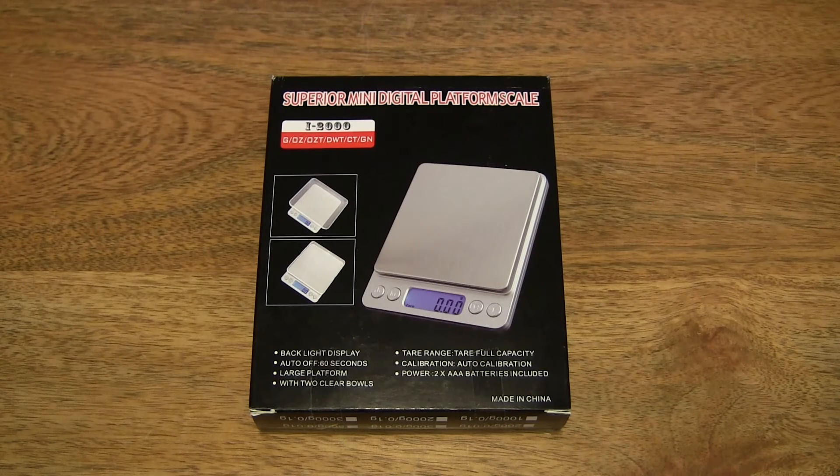Hello everybody! Today we're going to unbox the WesternTech Portable 500g Digital Scale, take a close-up look and test it out.